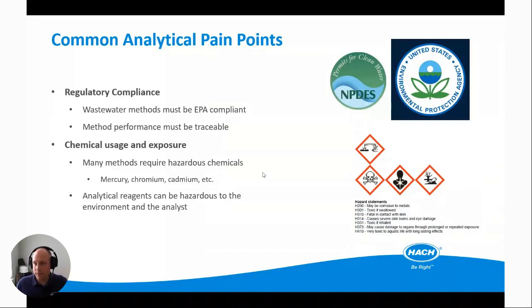So we end up with this situation where the analytical reagents themselves can be hazardous to the environment and the analyst.